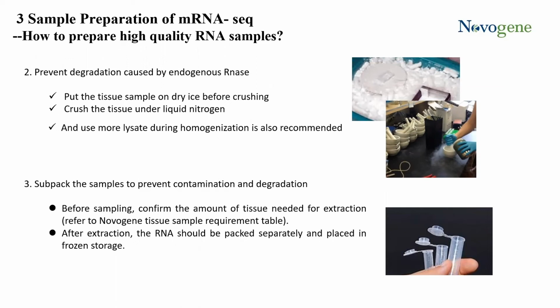Also, after extraction, the RNA should be packed separately and placed in frozen storage. Please avoid freeze-thaws to avoid any kind of degradation.